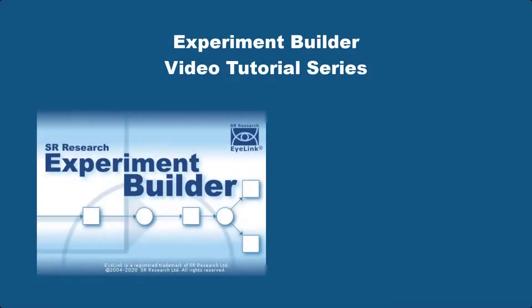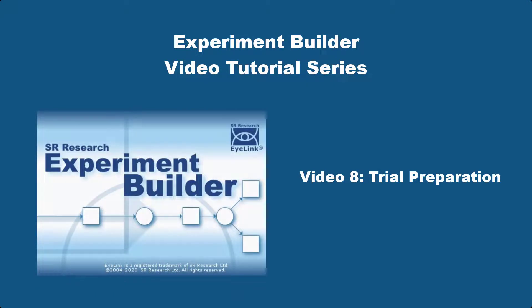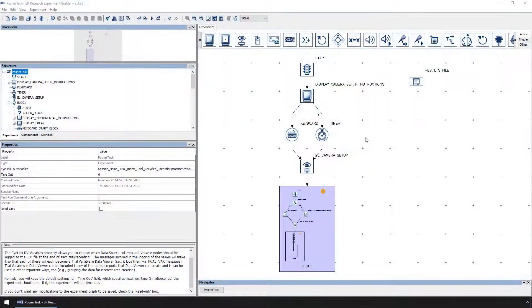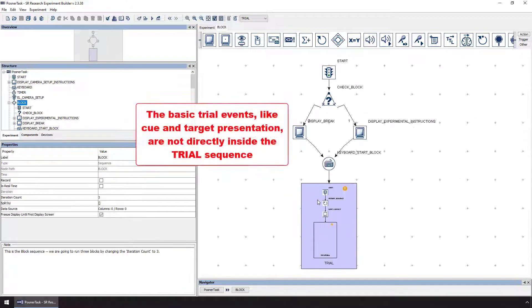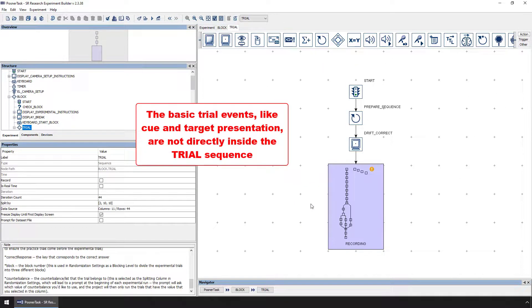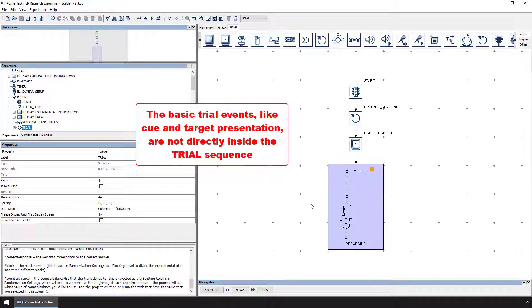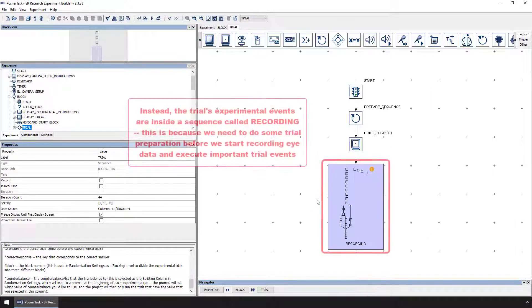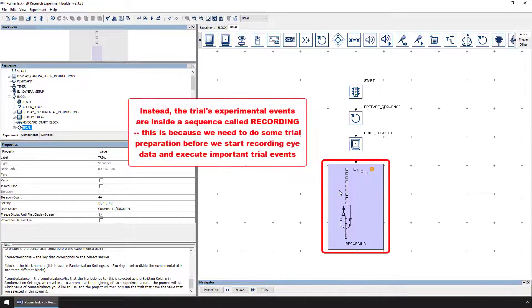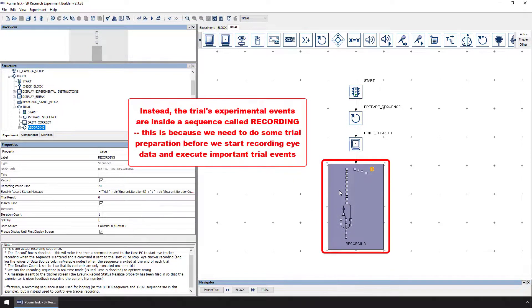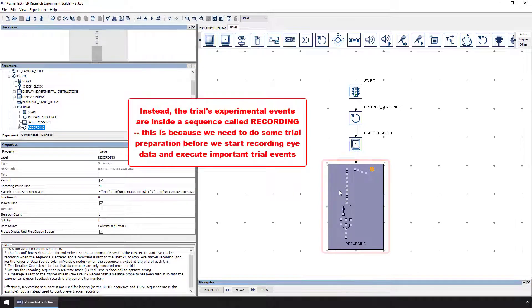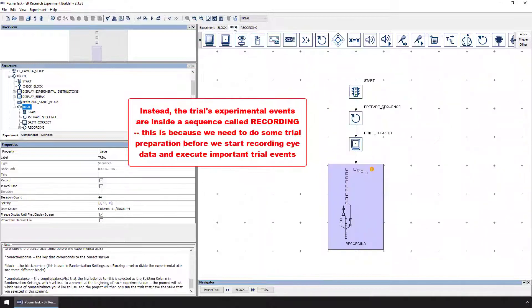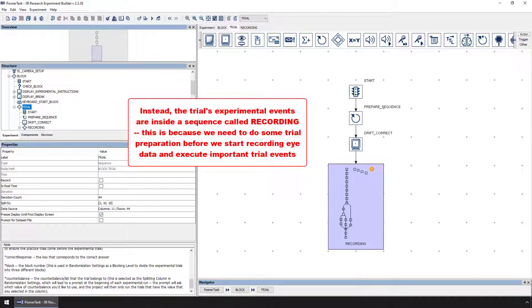In this video, we'll discuss trial preparation considerations in Experiment Builder. You might have noticed that the basic trial events, like the presentation of the images to the participant, are not directly inside the trial sequence. Instead, they are placed inside of a sequence that has been labeled recording. This is because we need to do a little bit of trial preparation before we actually start recording eye movement data and executing the important trial events.